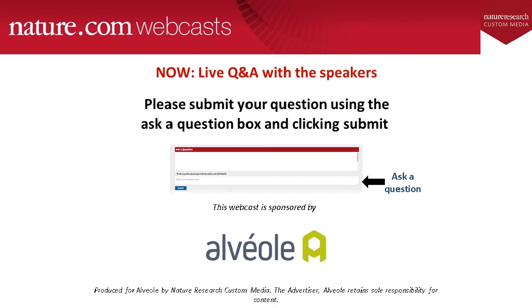Okay, so we have actually, in some cases, started to move away from using these silicone stencils. As I've gotten better at handling the grids, I feel more confident in my ability to do that. And so it turns out if you're careful, and I'll start off by quite literally answering the question, in some cases, if you add the stencil to the grid and then pull it off, it can take some of the carbon film with it.